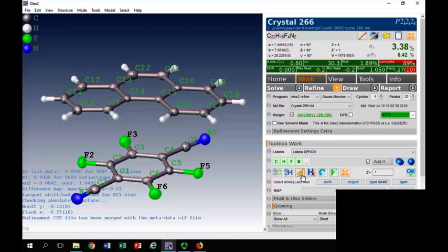So that's pretty much what you'll need to do for your assignment. Now, I think in your assignment, they've all been done before by myself, so I know they're easily solved. They might be complicated structures, but the solution and refinement is relatively easy, so there shouldn't be too many problems. It will give you a false impression of crystallography in that it's easy. You click on solve and there it is. Well, actually there's no sense of enjoyment or fulfillment in solving a crystal structure like that.